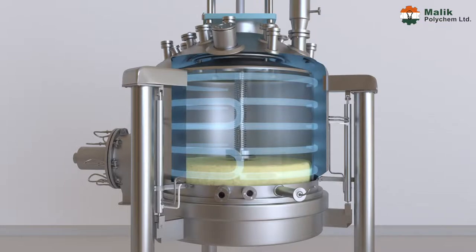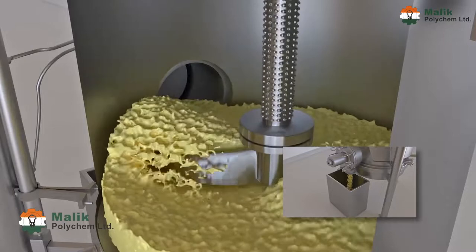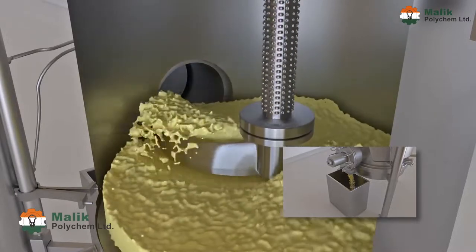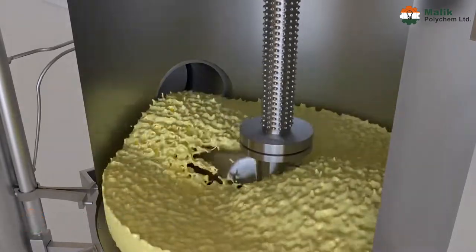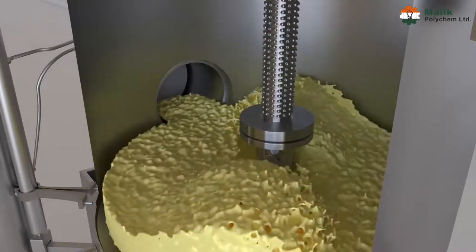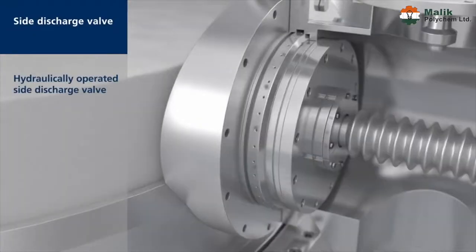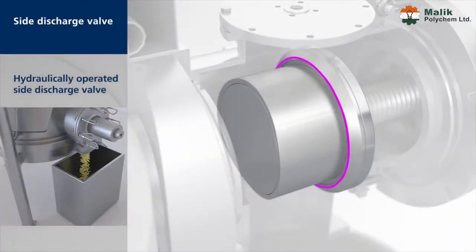Fourth stage — discharging: after approval of the sample, the product is cooled down to ambient temperature prior to discharge by applying cooling in the limpet. Finally, the S-shaped blade peels, cuts, and scrapes the cake and pushes it towards the periphery by rotating the agitator blade in an anti-clockwise direction, expelling the final product through the hydraulically operated discharge valve.